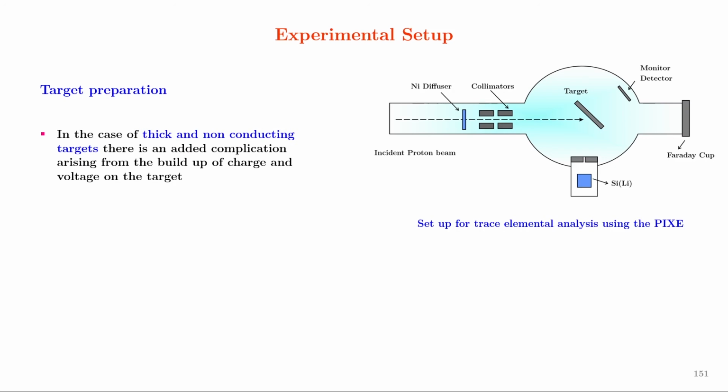In the case of thick and non-conducting targets, there is an added complication arising from the buildup of charge and voltage on the target.